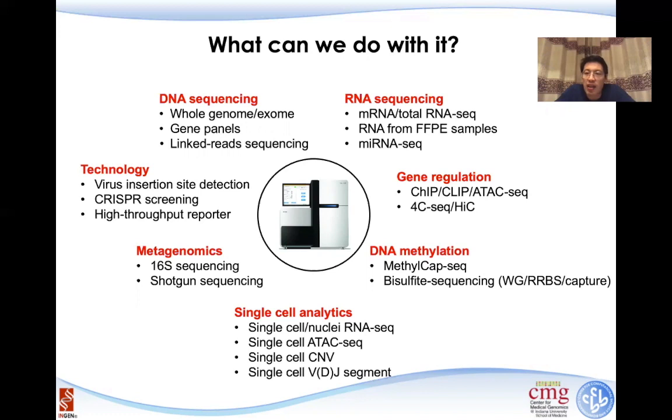So this is the end of this module. Starting from the next one, I'm going to start talking about the very basics of next generation sequencing data analysis. We'll start from the data format.